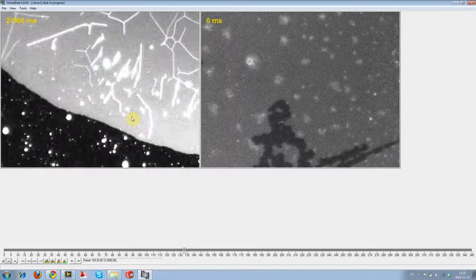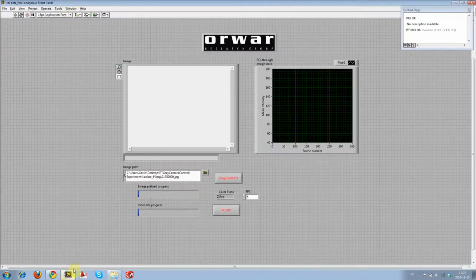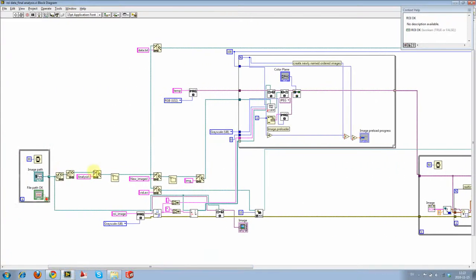This is the final goal for this set of sessions. It's going to get a little bit hectic today, and there's going to be questions, but you might just have to go through and watch the class a couple of times because there's going to be sections which get problematic. One of the issues that always pops up, whether you're used to it or not, is the file handling section, and it always gets kind of waffly.